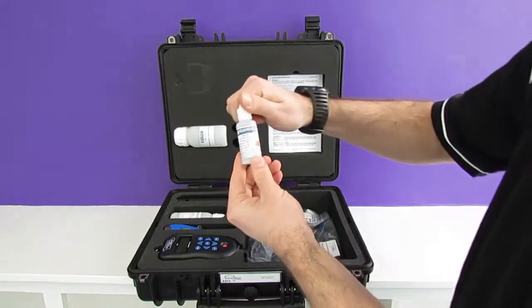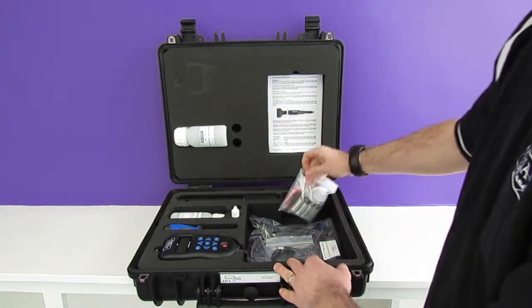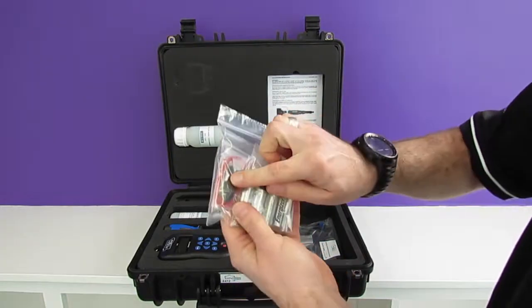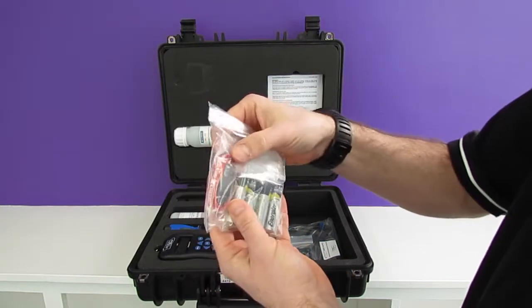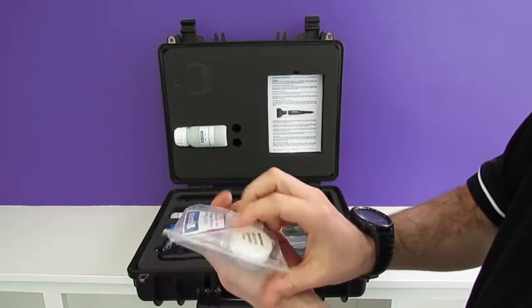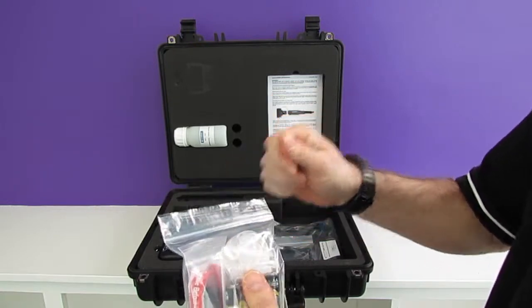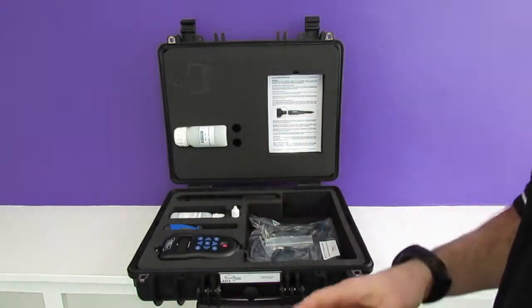We also have some storage solution. This will go in the pH storage cap which we can see here in this accessory pack. This is to keep the pH sensor moist in between uses, and you remove this when you're obviously using it. It comes with some silicone grease to grease all the threads and keep everything nice and smooth, and also some batteries for the meter to get you going.